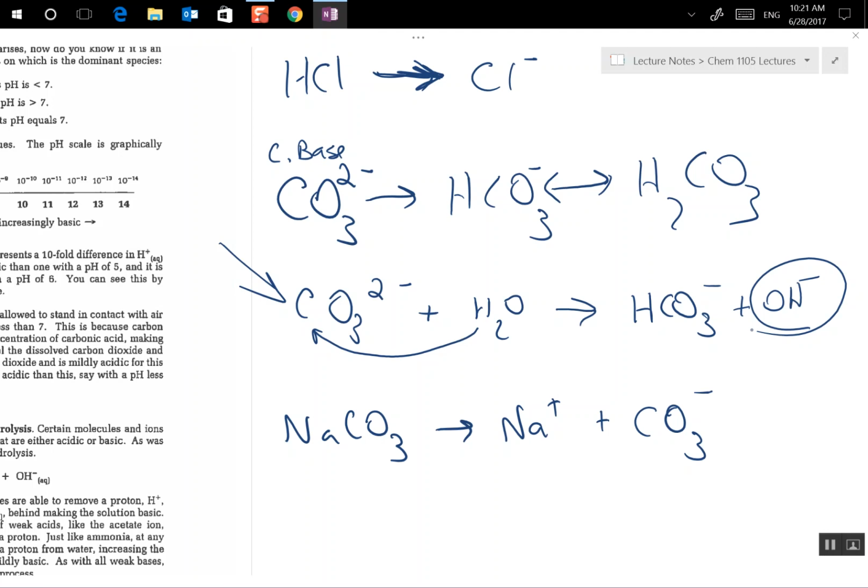Carbon dioxide actually, when it dissolves in water, produces carbonic acid, which makes it acidic. So carbon dioxide will cause your solution to become acidic. And in fact, a lot of times, you know these bottles here of DI water, you guys measure the pH of the water in the lab, of the DI water, and you're like, Mr. Crown, it's like a pH of 5 or something.